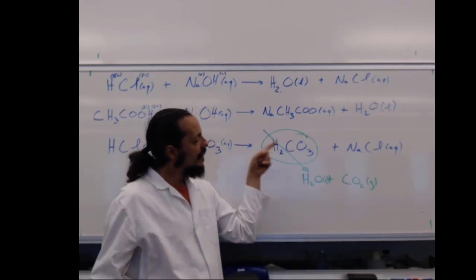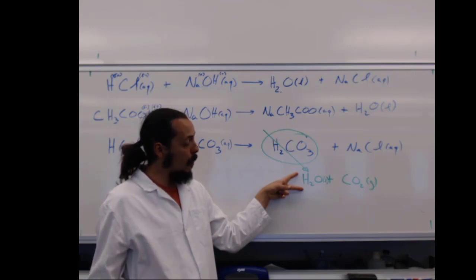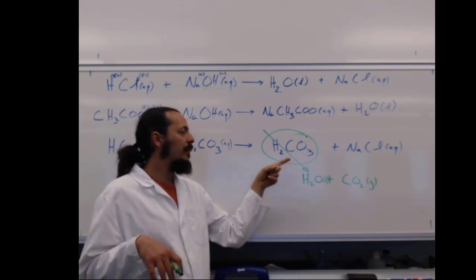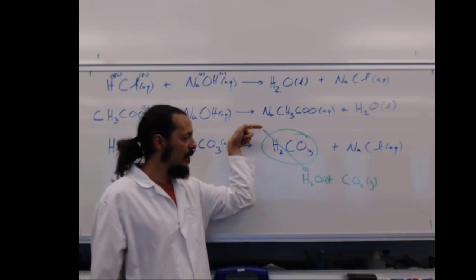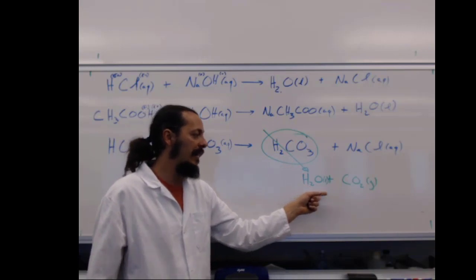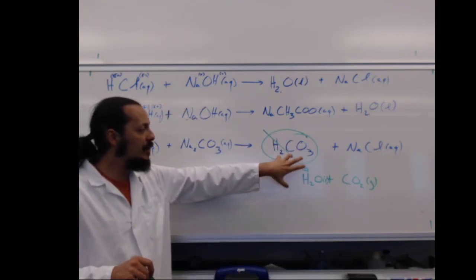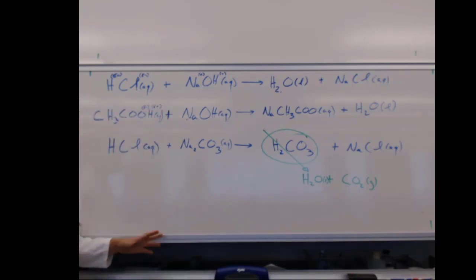But carbonic acid will decompose into CO2, or if you put CO2 in a tight container with water, you can form carbonic acid. Since we're doing this in the open atmosphere, this is going to go to H2O and CO2. So this formation of the H2CO3 breaks apart. Let's go ahead and do these reactions and take a look at them.